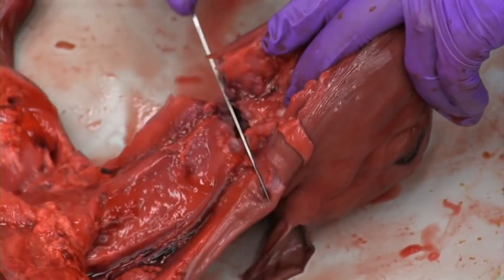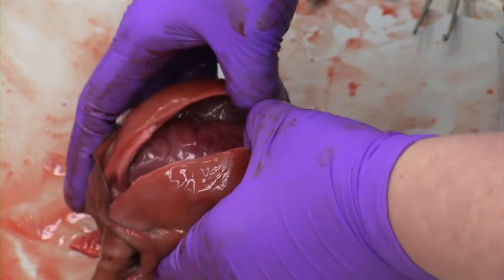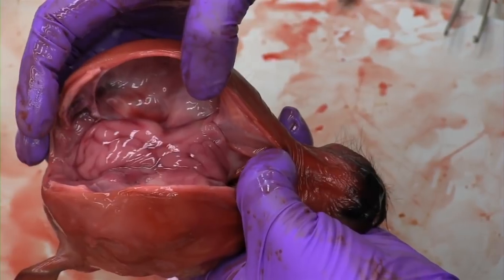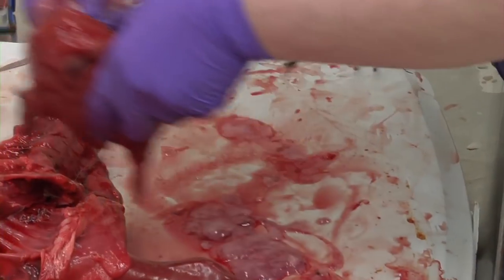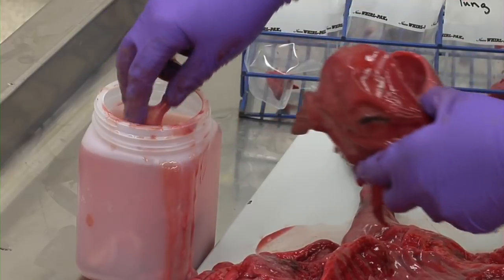Next, disarticulate the head at the atlantooccipital joint. Cut the skull in half or remove the bony skull cap to expose the entire brain. Again, the brain is the only tissue that does not need to be one centimeter or less in thickness for fixation in formalin. Even if the brain appears quite soft or soupy, it should be collected and submitted as fixed tissue.